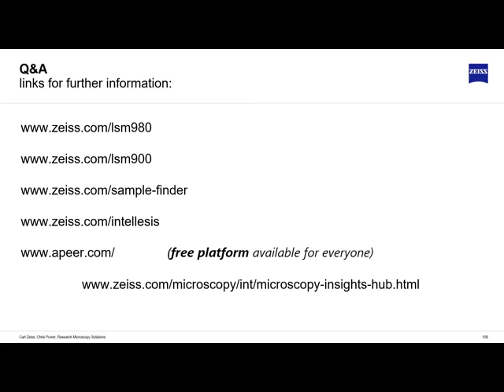But the other way of coming at that are the techniques I mentioned in the first part of the talk. People don't just take an image these days, or they don't just do a FRET experiment. The best systems biology labs ask the same question in multiple ways. So if you can use FCS, if you can use RICS, if you can use these techniques to verify your data in 3 or 4 different ways, you have much greater confidence that what you see is real.